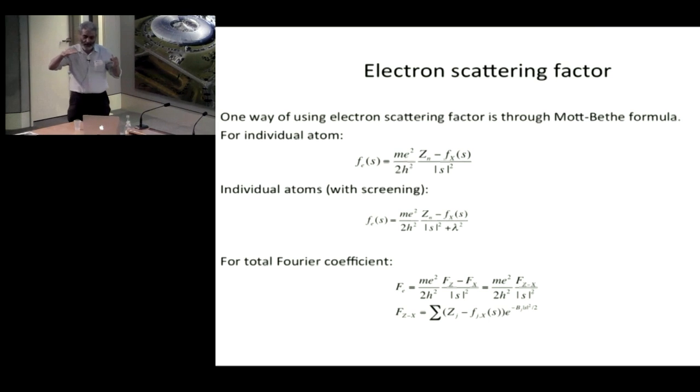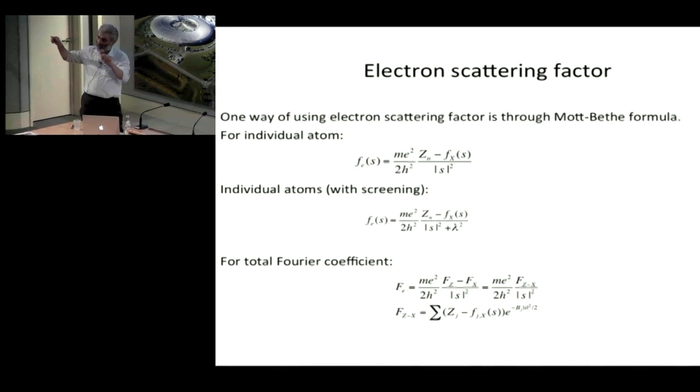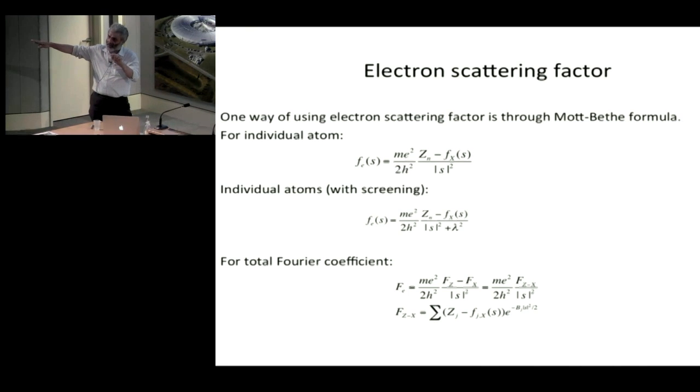What does that mean in image space? In molecular space, it means that the effect of charges would go as Coulombic interactions, and the effect would be extremely large, and at very long distances.